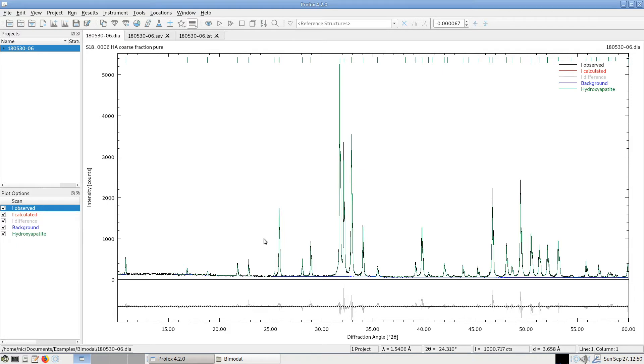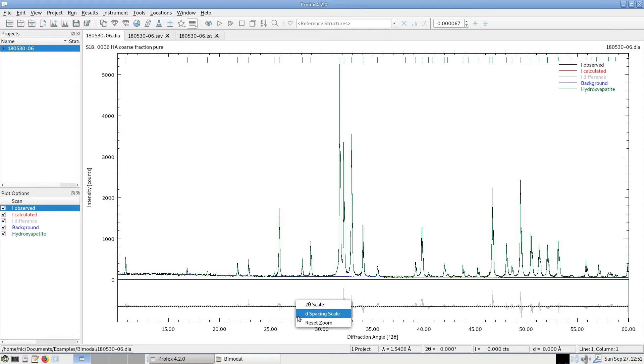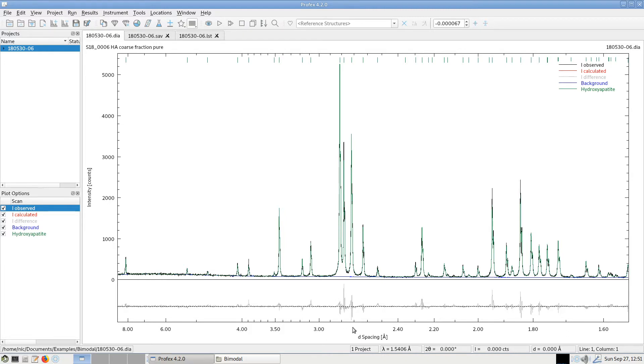If we go to the area below the x-axis, we also get a context menu with the right mouse button specific for the x-axis scale. Now it's set to 2-theta scale. And we can change it to d-spacing scale. So now it shows the d-value in Ångström. This is again volatile. If we close the project and open it again, it will be set back to 2-theta. And for a permanent change, we could go to the settings and change it there.